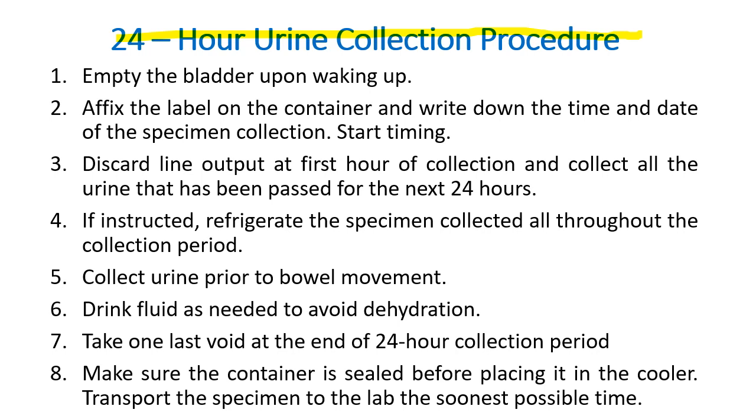So affix the label on the container and write down the time and date of the specimen, start timing, discard urine output at first hour of collection, and collect all the urine that has been passed for the next 24 hours. Tapos, nire-refrigerate yan. Tapos, drink fluid as needed to avoid dehydration.